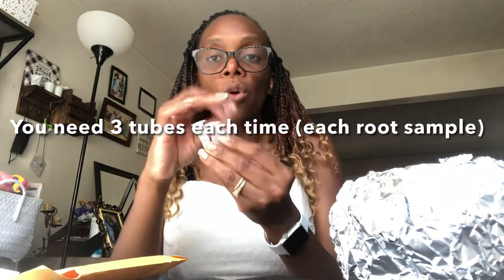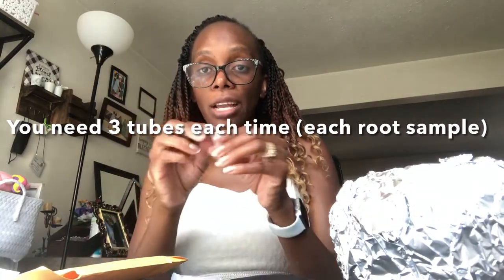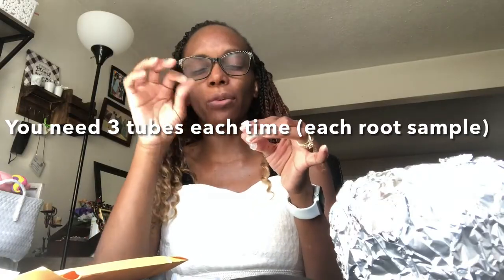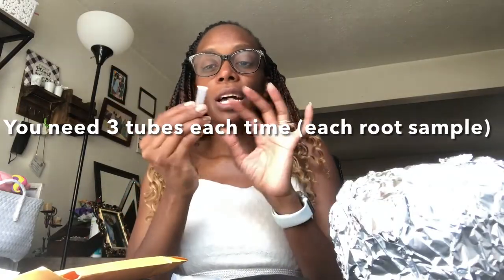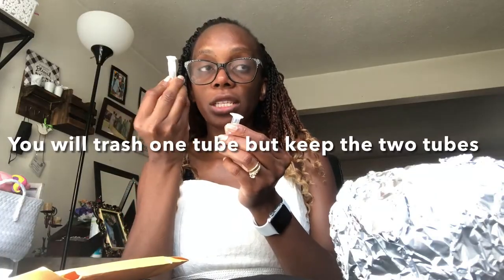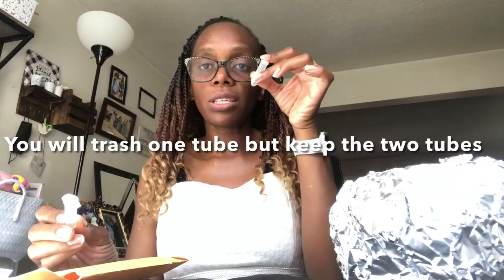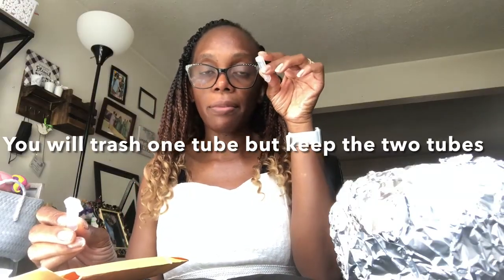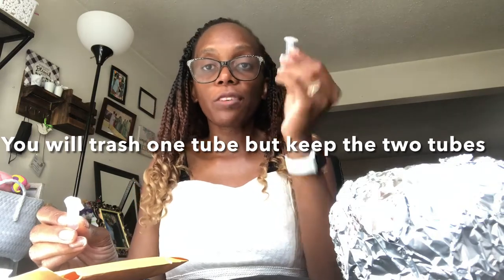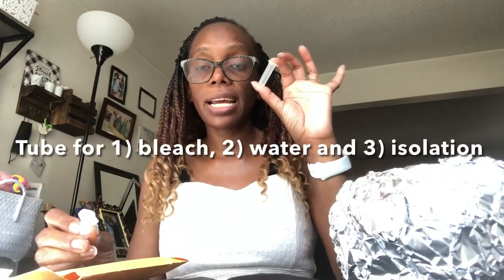One of them will be the one where we will finally do our isolation. We'll crush our root segment in it, and once that is done, you can just trash it. The other 2 tubes, you can actually use. One of them we will fill with just clean water. In the other one, we will dilute a little bit of bleach and add a lot of water, and then mix it up. The bleach diluted solution is going to be our first one, and the purpose of that is to sterilize our root segment.